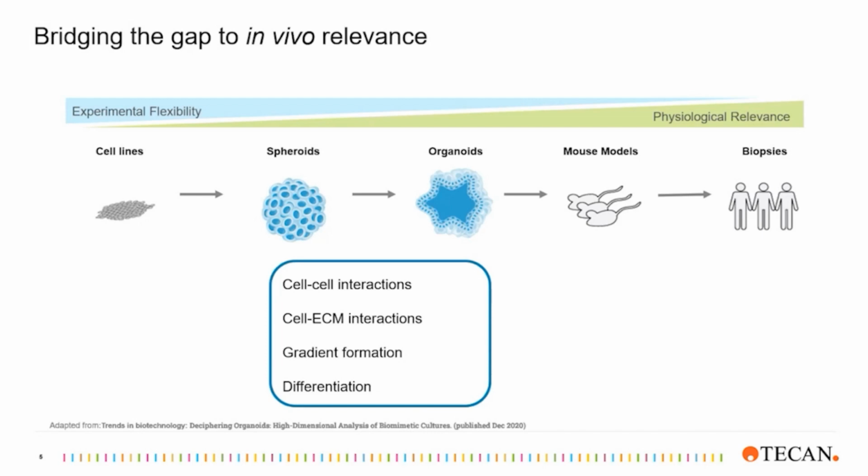And this is particularly important when considering tumor response and in contrast to 2D cultures where all cells are exposed to the same factors and drugs. Given the right environment and signals, cells have the potential to differentiate into various cell types and form structures which mimic the organ or tissue. And adding 3D cell models into experimental workflows can bridge this gap and give more physiologically relevant insights early on.